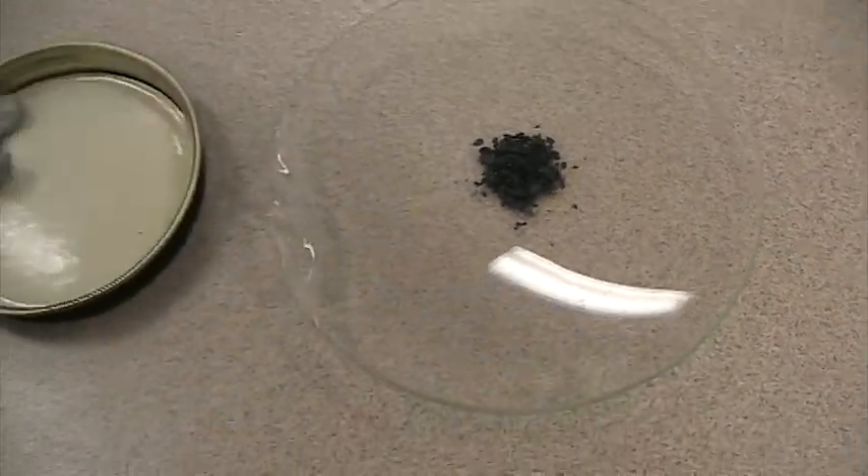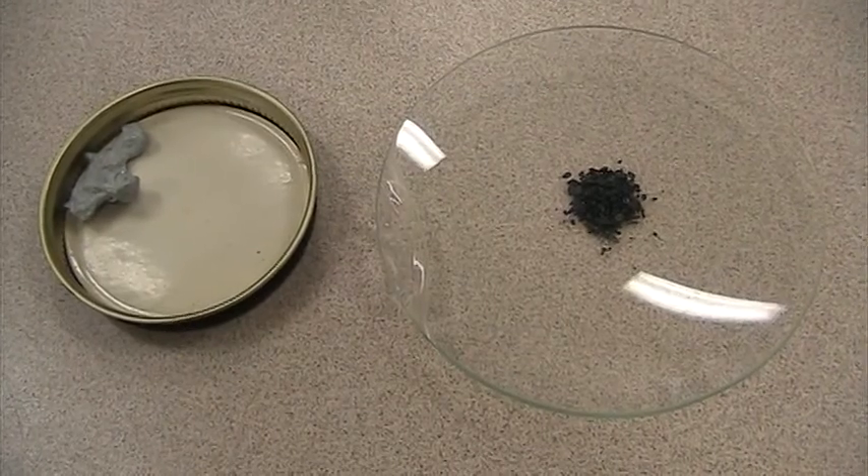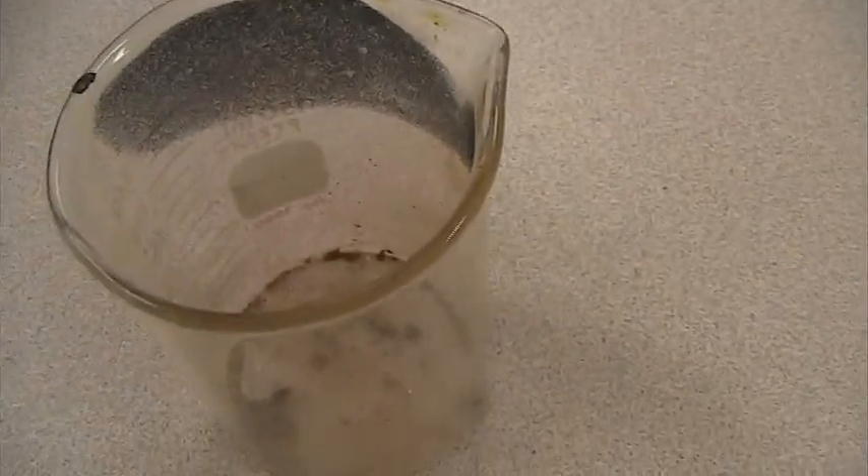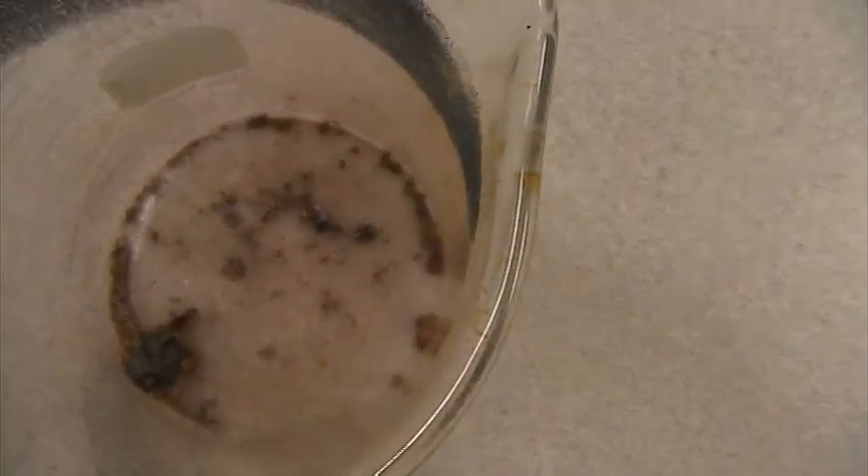So we've reacted these two elements, zinc and iodine. We had to heat them up in a beaker. The beaker was covered. A purple gas formed, and you see a chunk of zinc now covered in something else, zinc iodide.